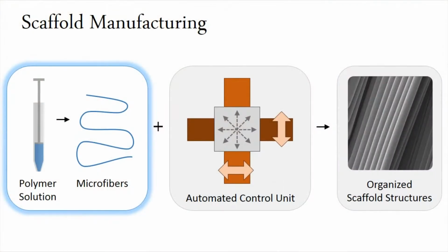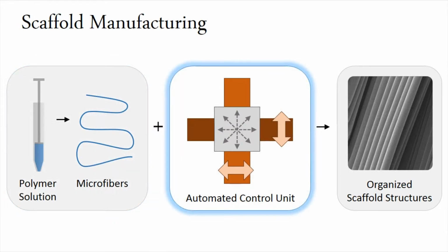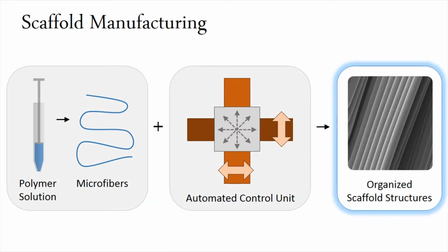When I joined the lab in September of 2013, a scaffold fabrication process had already been designed and developed by my colleagues. It generates fibers from a polymer solution and uses an automated control unit to create organized structures that function as tissue engineering scaffolds.